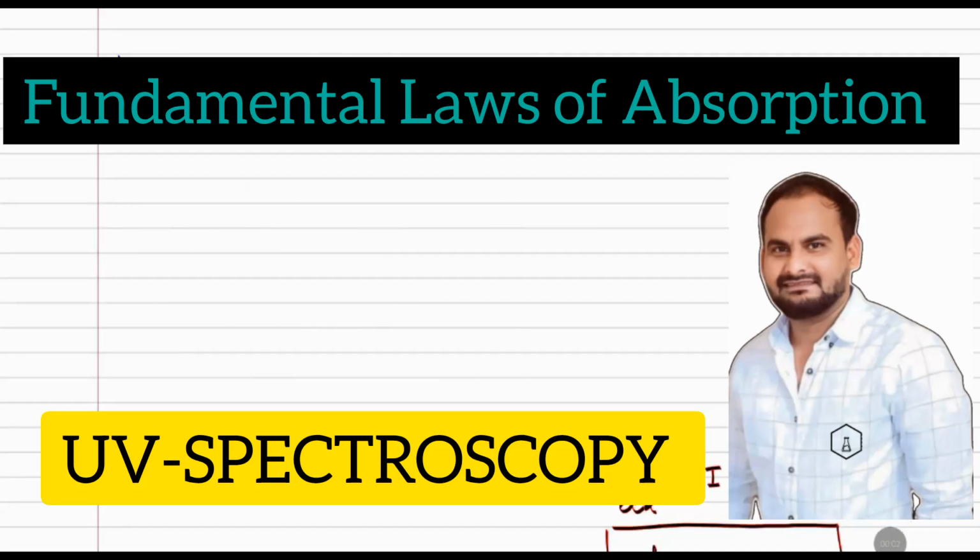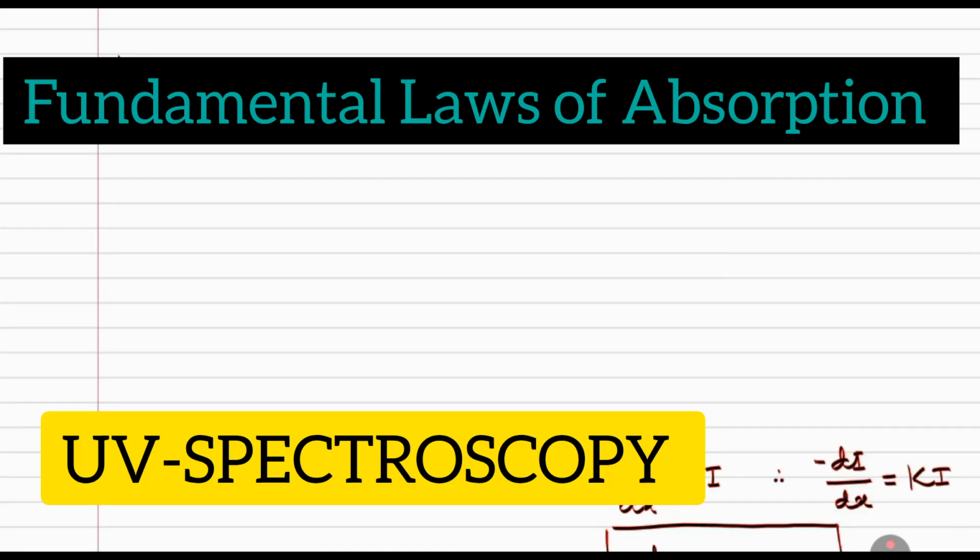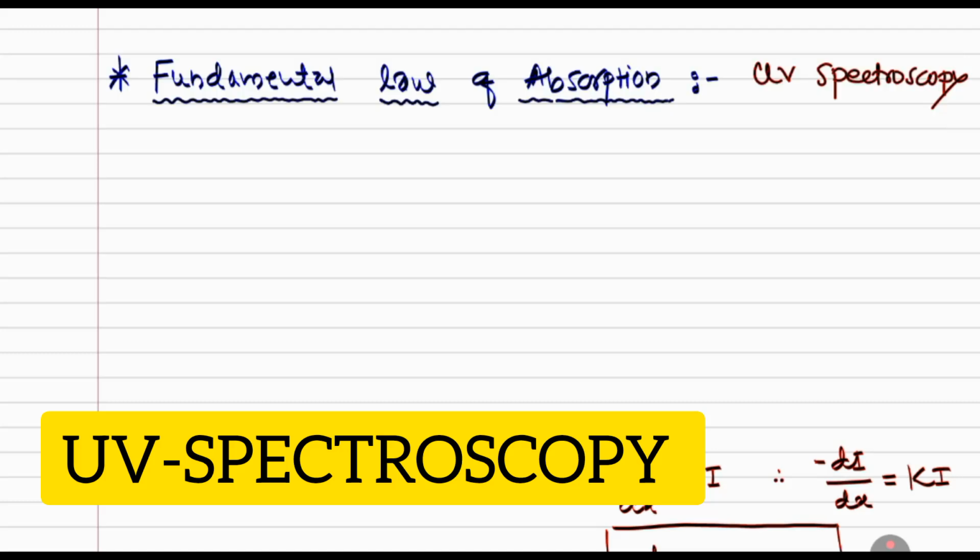Today what we're going to see are the basic and fundamental laws of absorption in UV spectroscopy. We are talking about UV spectroscopy. There are some important laws which are given to explain the process of absorption.